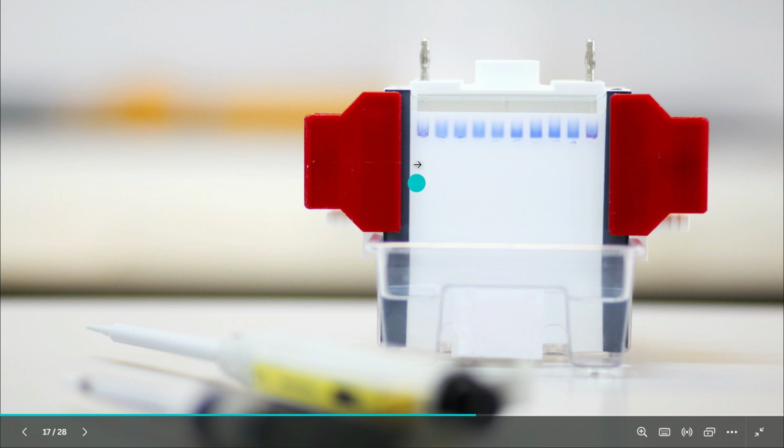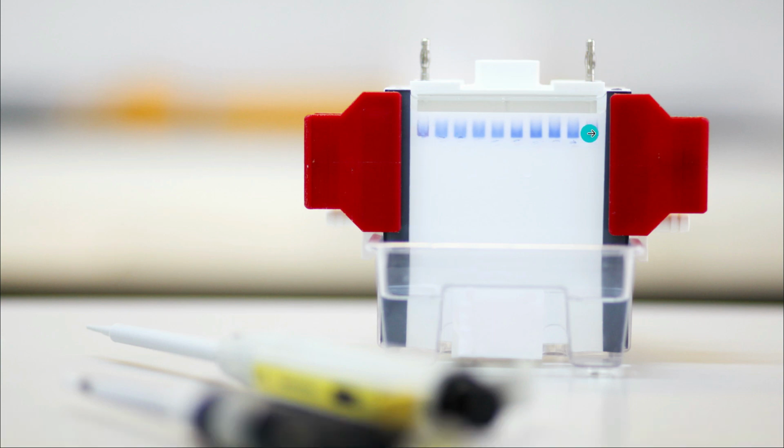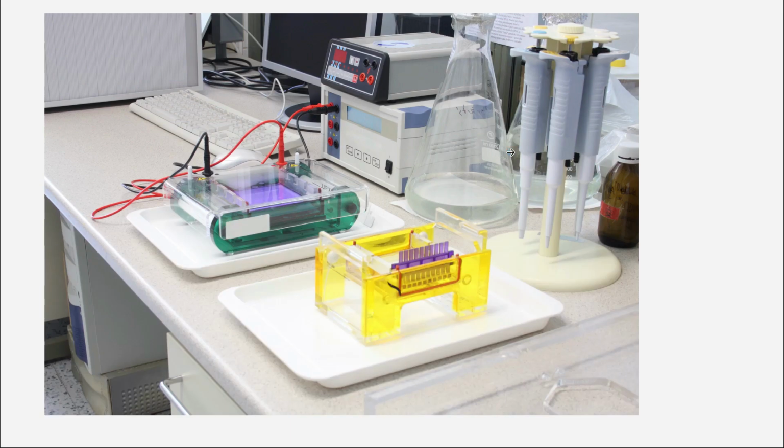And once we add the mixture and apply the electricity, it starts migrating. Here you can see this provides the electricity, and here it starts migrating.